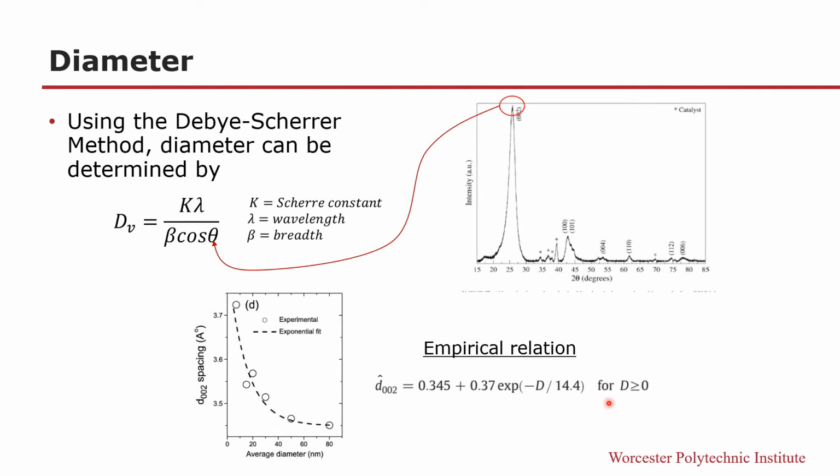In terms of multi-walled carbon nanotubes, with more layers causing more scattering of the 002 peak, it tends to be broader than single-walled carbon nanotubes, making diameter calculations less accurate. But it was found that the Bragg angle increases and the full width half max decreases for the 002 peak as the diameter gets larger. This is also a strain factor which plays into the diffraction, but could potentially be lattice alignment being more ordered for larger multi-wall carbon nanotubes, thus reducing scattering.